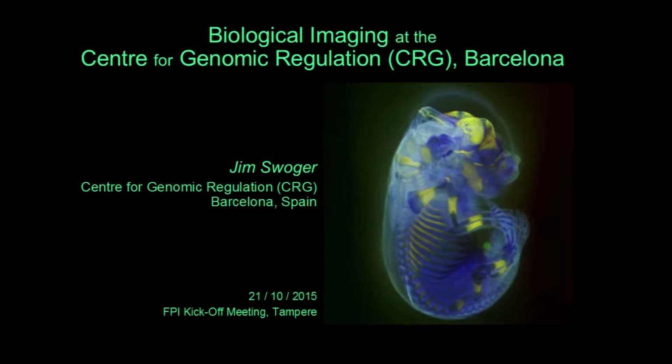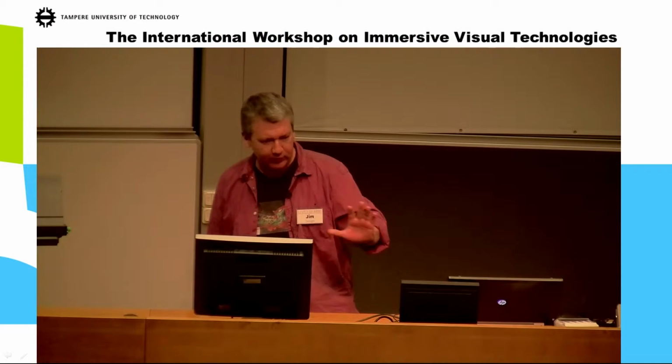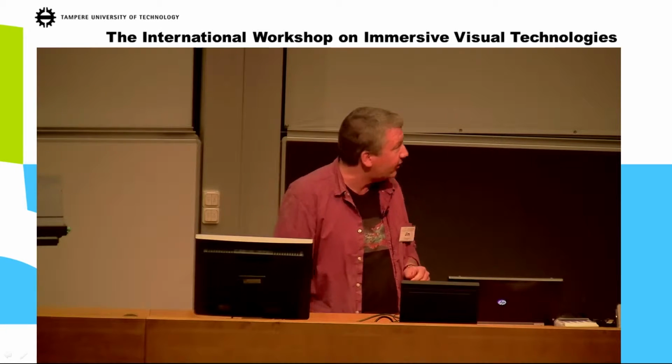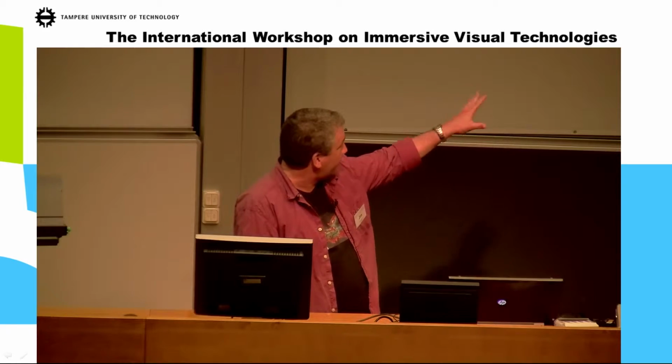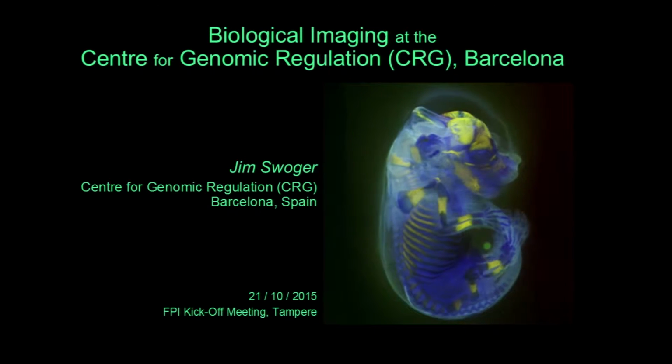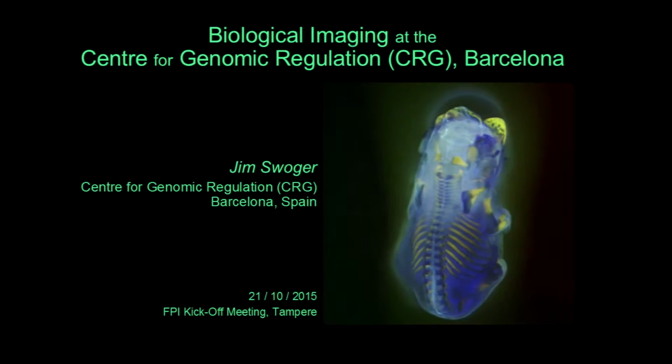We're trying to do 3D imaging. The display stuff is really beyond us. If I could display some of the wonderful ways you guys have shown so far, it'd be great. But things like this are just plain old projections through our samples. So what I'm going to talk about is the acquisition of the data that we've got.